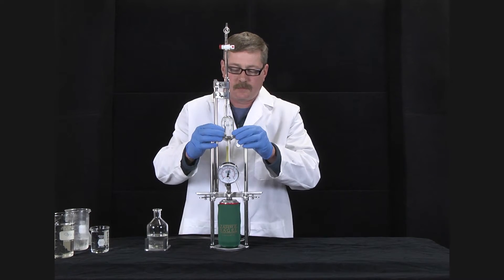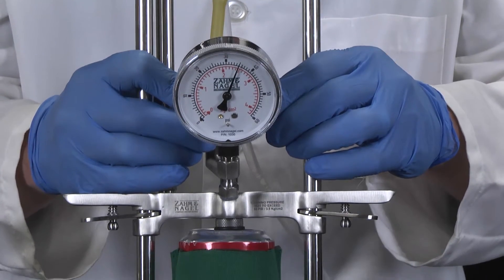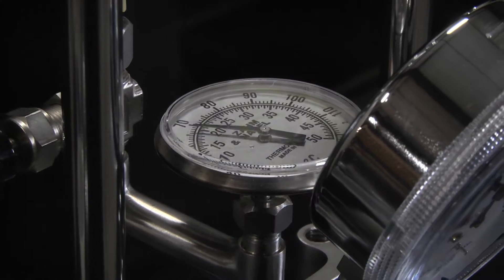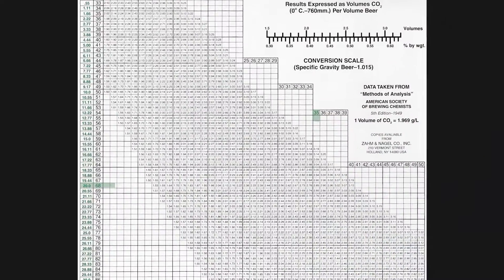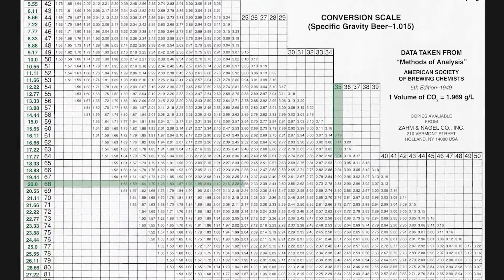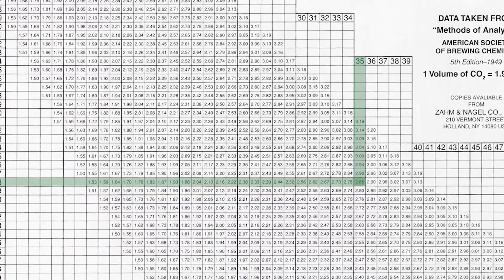To test the CO2 volume, record the pressure and insert the dial thermometer down into the container to its fullest extent. When the reading is steady, record the temperature. Refer to the solubility of carbon dioxide in beer chart with your temperature and pressure readings to determine the volumes of CO2 gas present in the sample being tested.